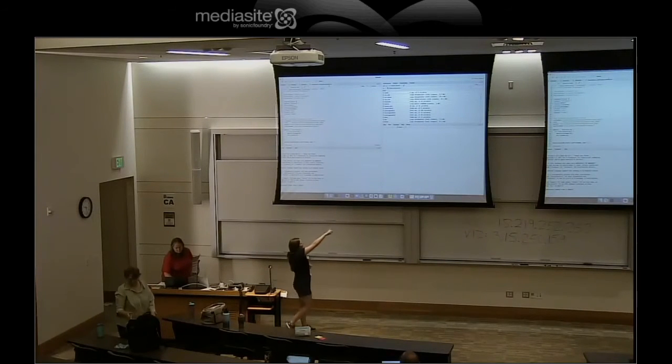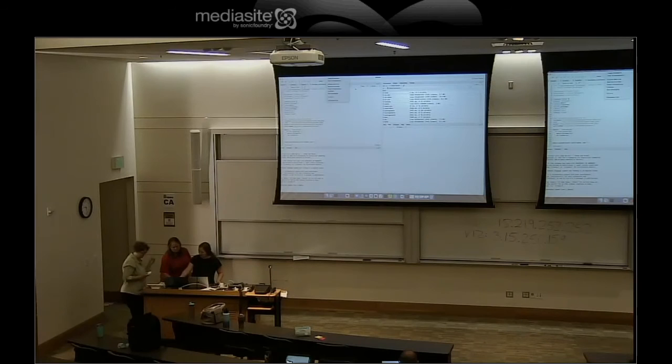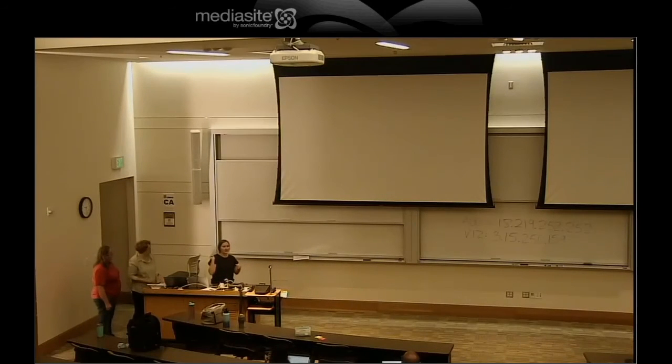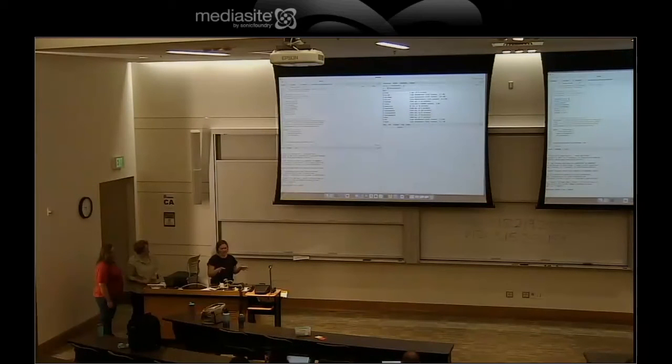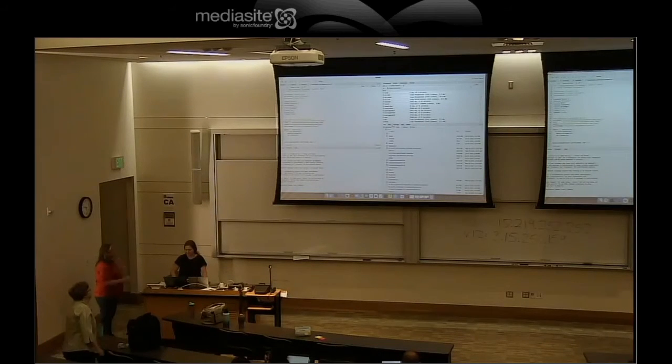Then this bottom panel right here, you can see that it has options on the bar for files, plots, packages. This is where, if you generate a plot in R, it'll pop up. If you want to go to a specific file, you can click on that and it's like going through folders on your computer. It's just an easier way to navigate in R. So like files, you can see here are all of Mary's files.